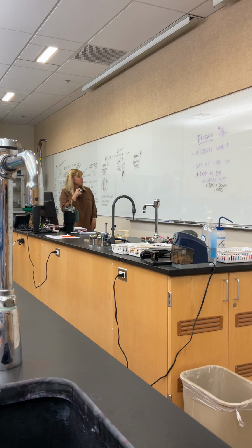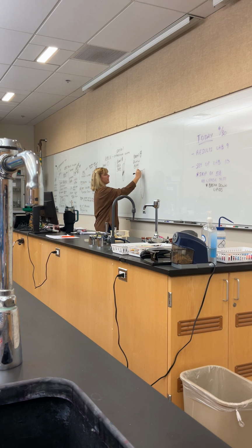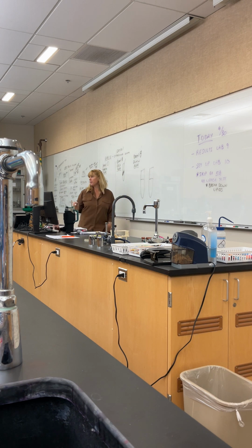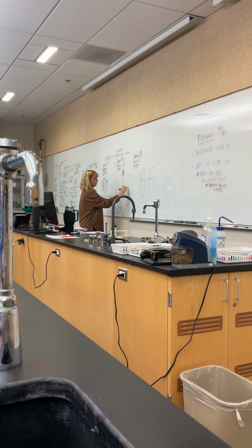And then the last one that we're gonna set up is our gelatin deeps. So these are going to have a very deep tube associated with them. And by the way, for the urea agar, you're going to separate that. One of you is going to set up E. coli, and then the other lab partner is going to set up Proteus. I think it's Vulgaris, right? Is that the one I have you guys set? Yeah. Okay, cool.